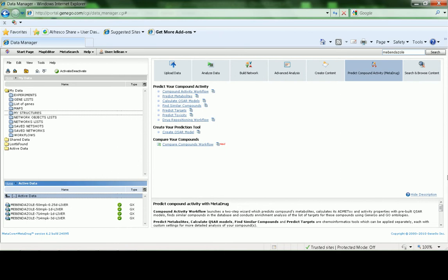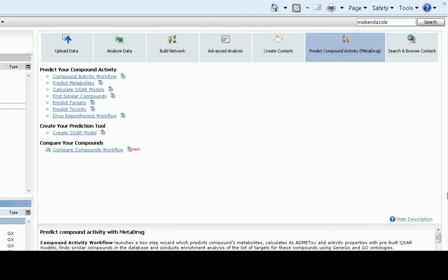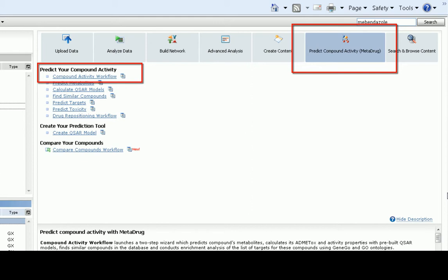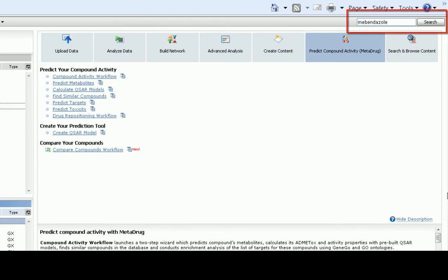We can start our analysis from the Predict Compound Activity tab on the Start page to upload the structure using all default settings. Alternatively, you can search for the structure of Mebendazole from our database.